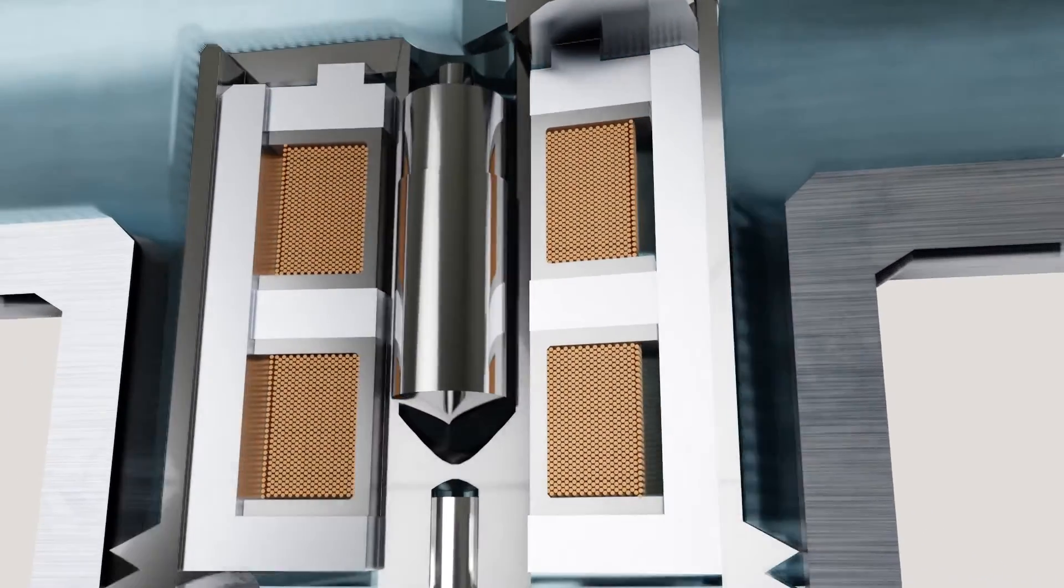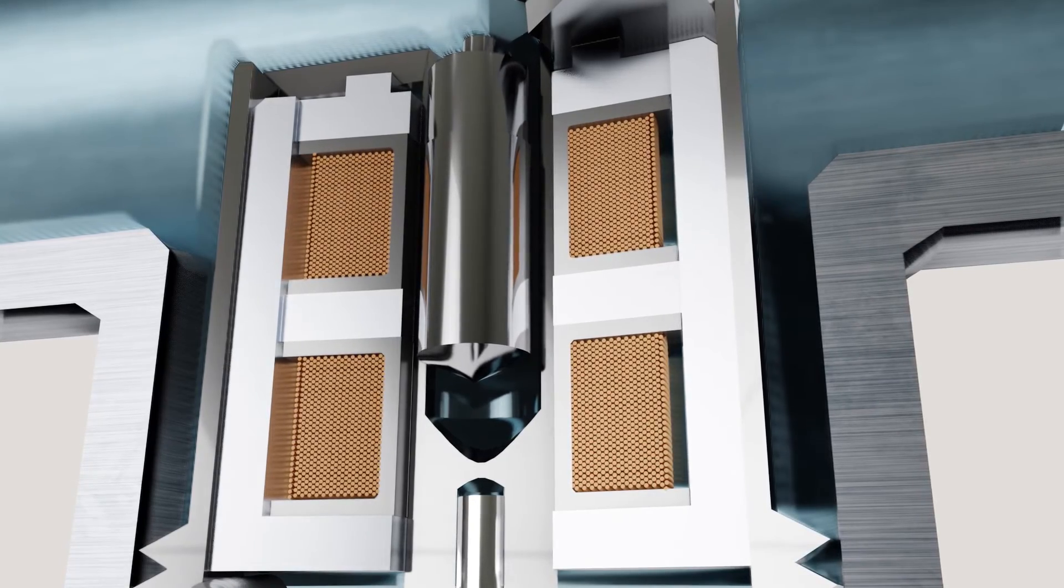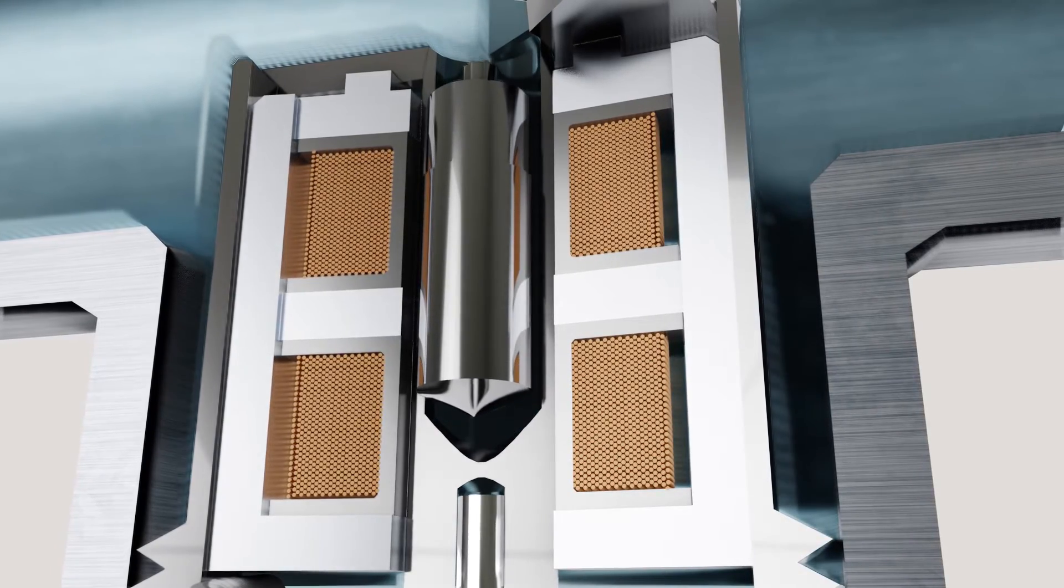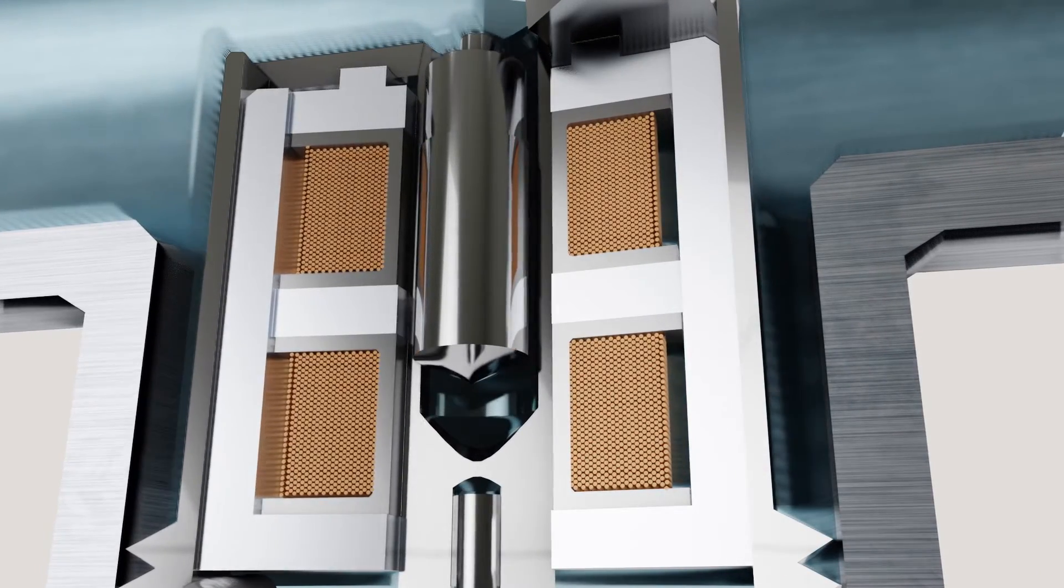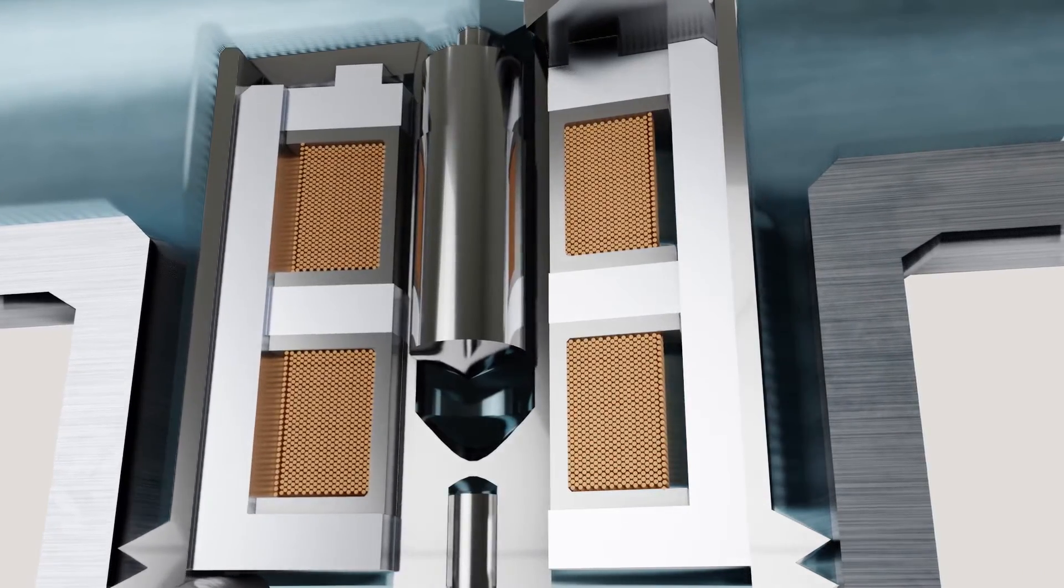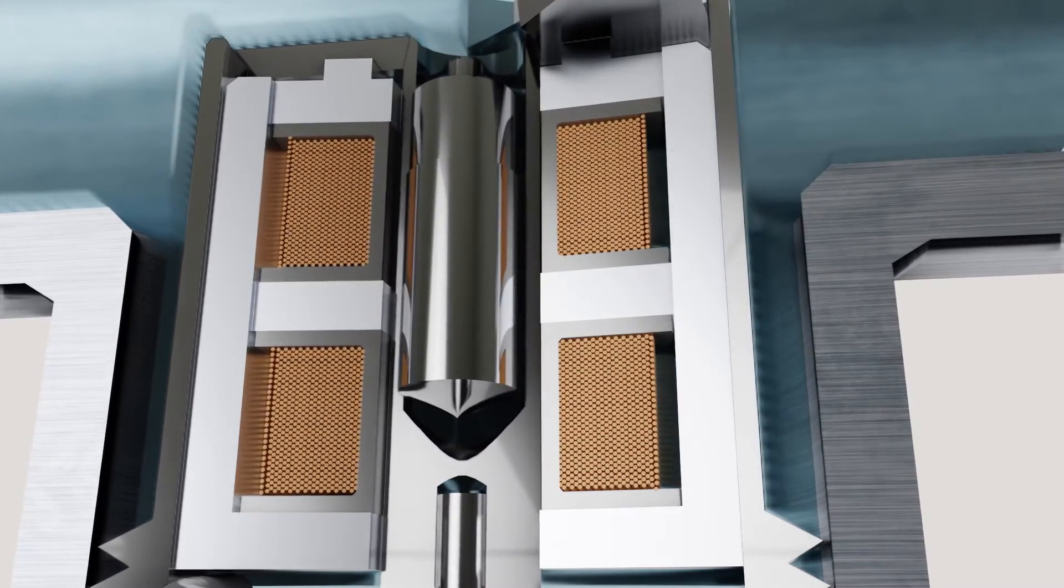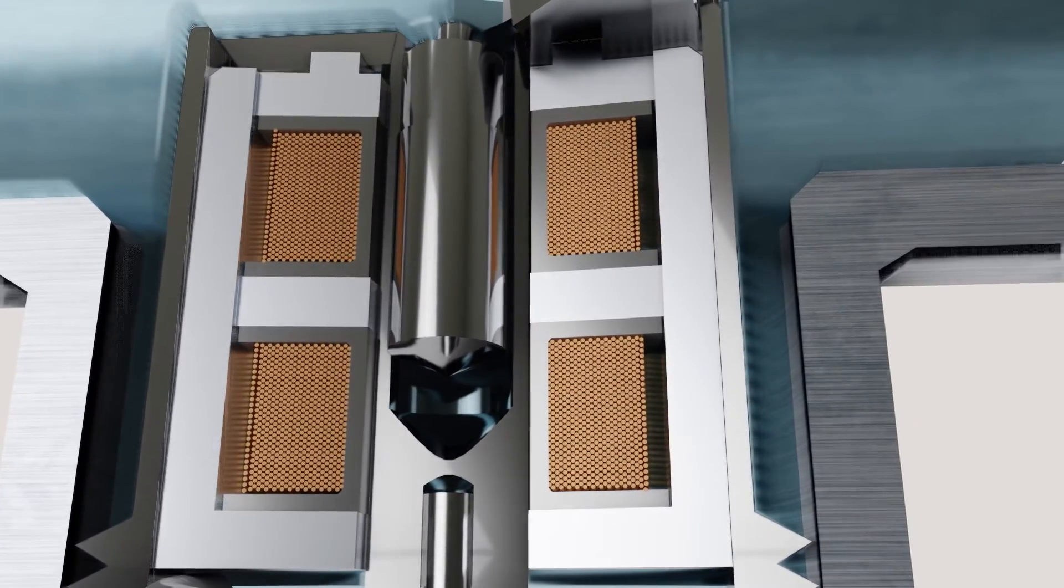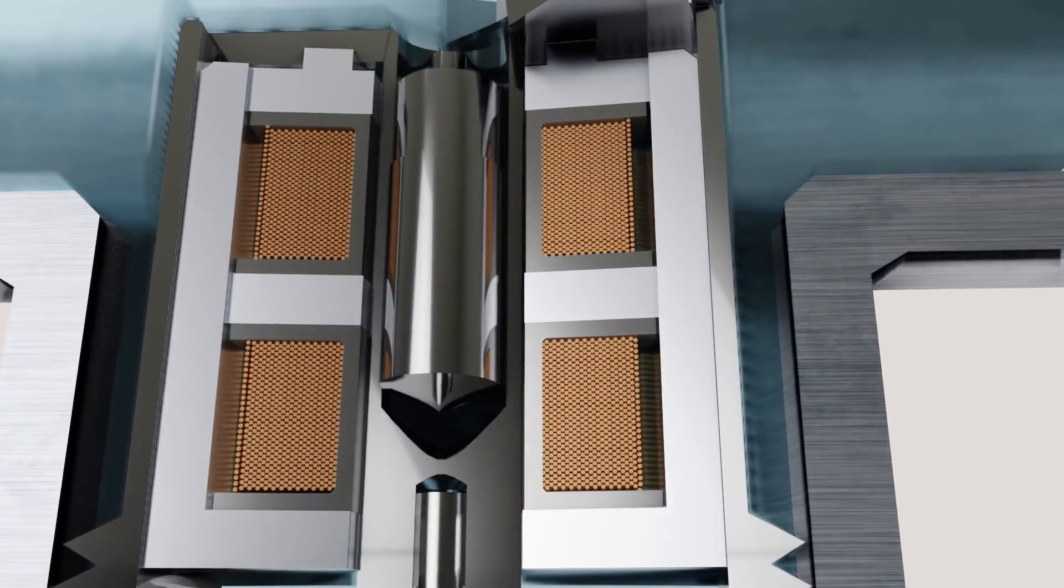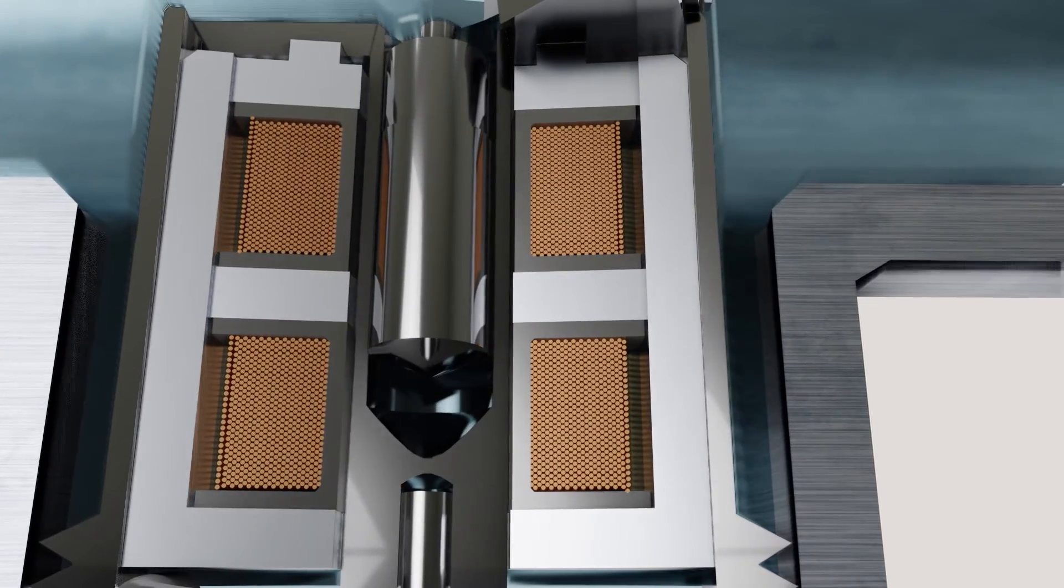Since all the parts that can become wet are made of stainless steel and the piston is in constant motion, the sampling area is continually scrubbed clean to prevent fouling. The system holds its calibration and requires little to no maintenance.